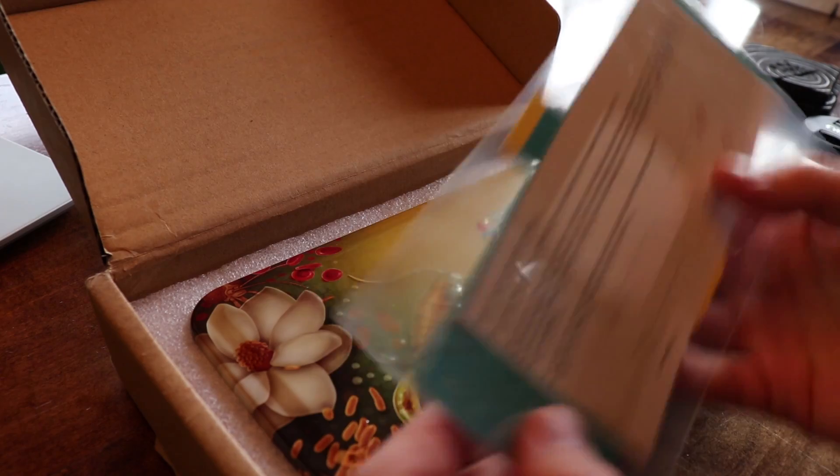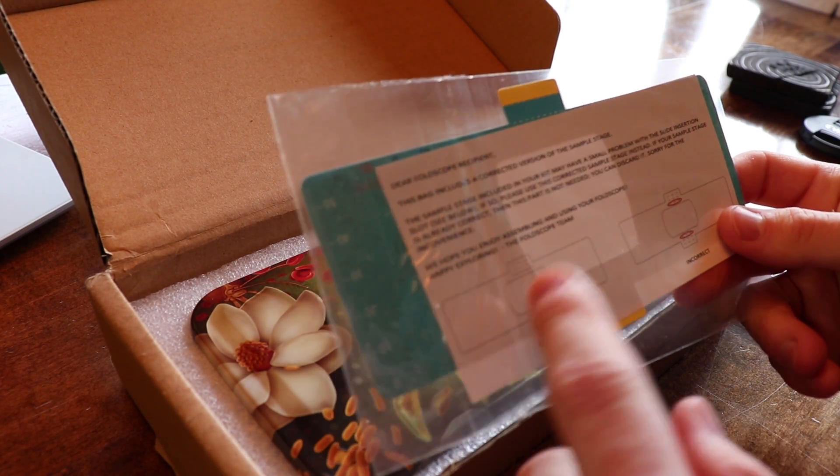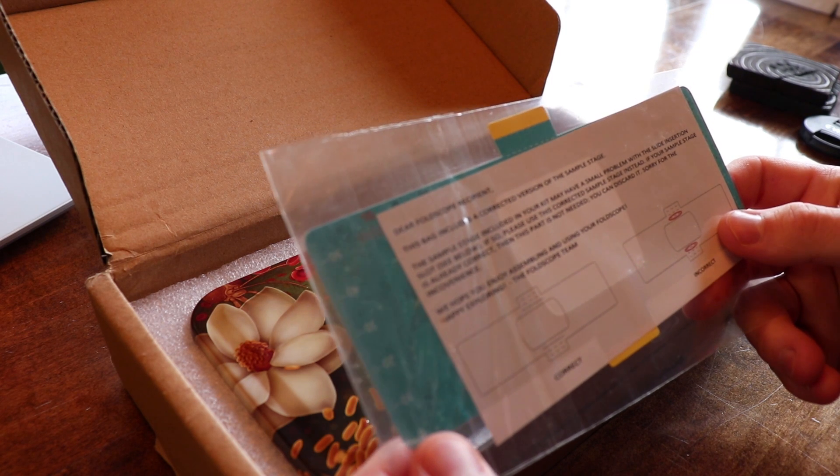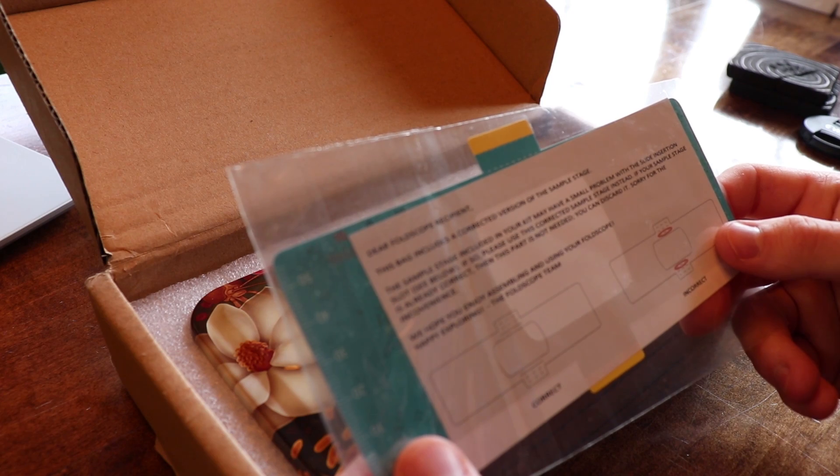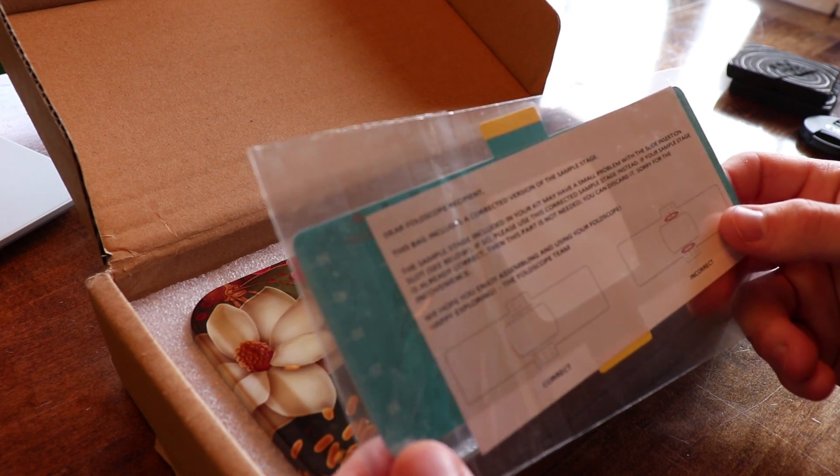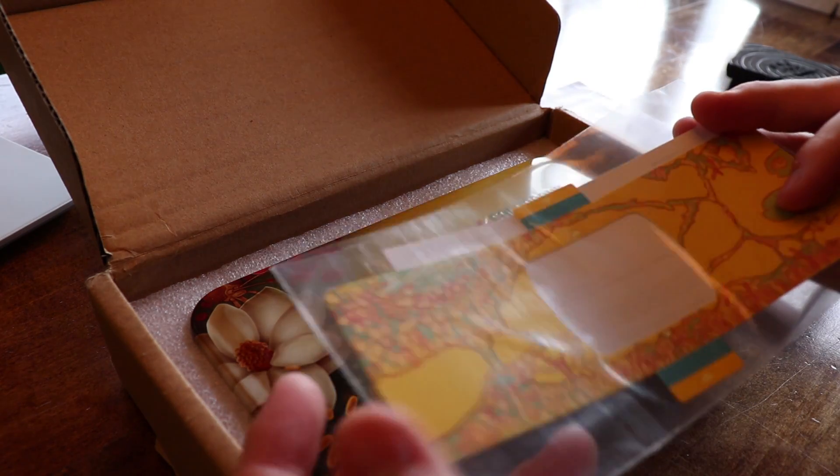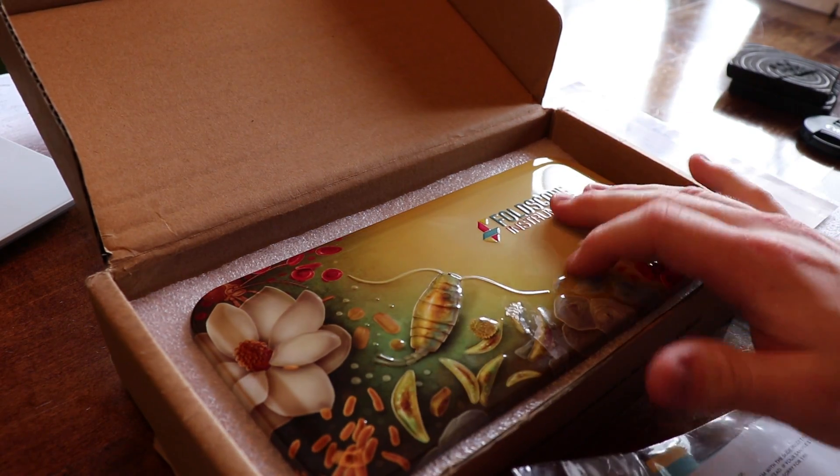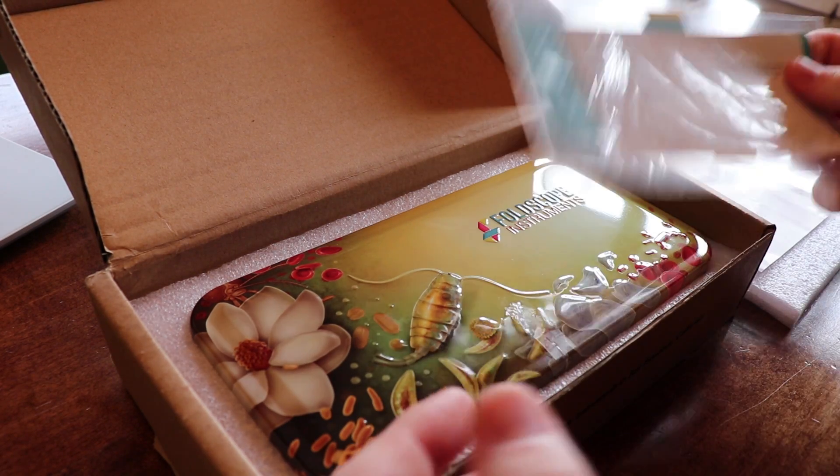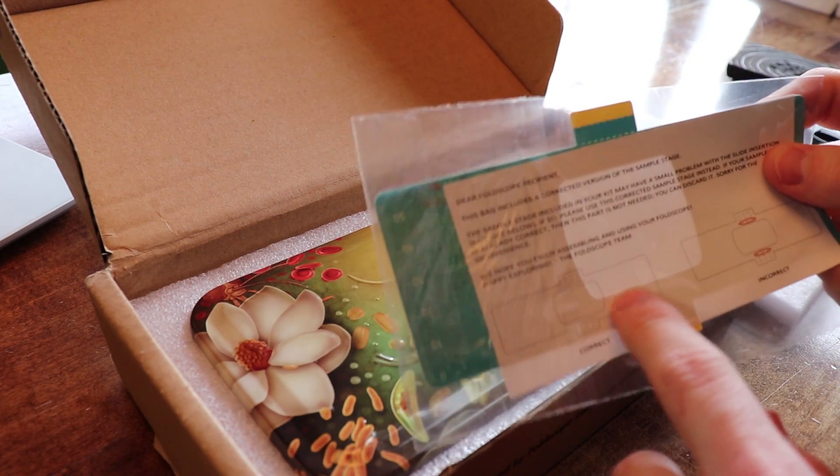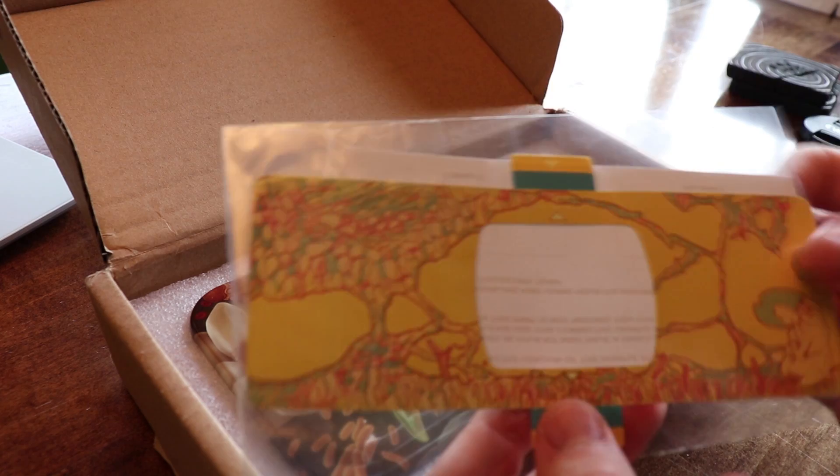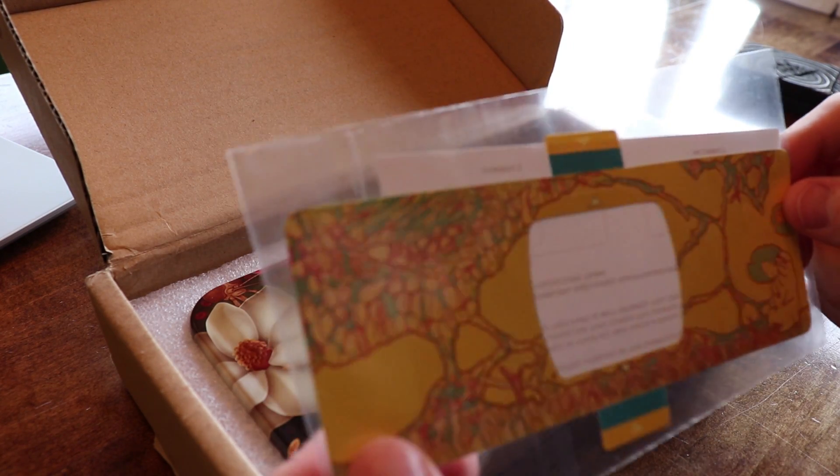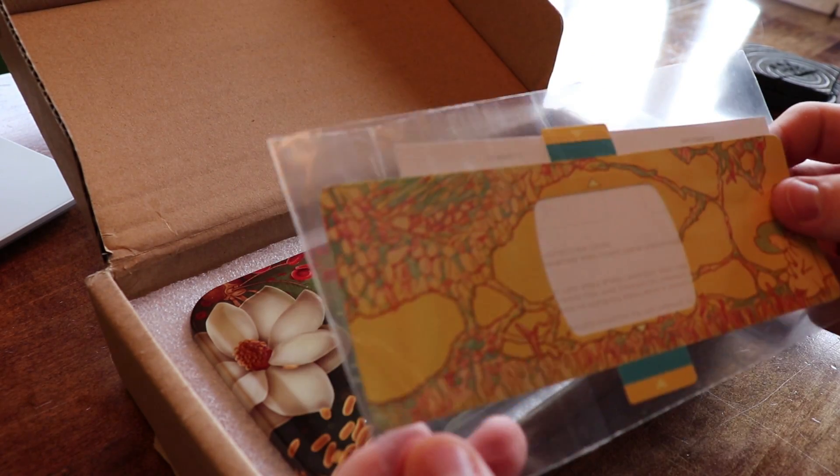Alright, so we have a corrected version of the sample stage. It may have a small problem with the slide insertion slot. So they went ahead and included the replacement part on top of the regular product. If this one contains the wrong setup stage or sample stage, then we will have the proper piece. See how this is just made out of paper. It's got a nice, fancy graphic on it. I'm sure the production ones for third world countries don't have that.